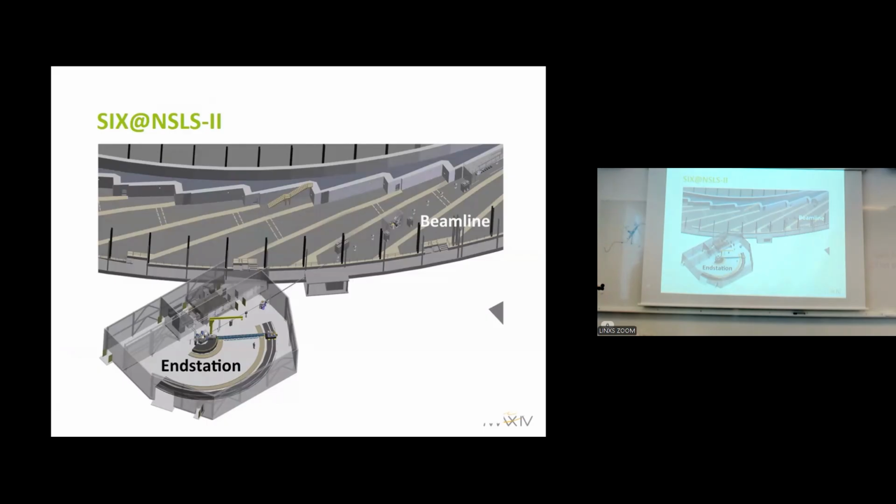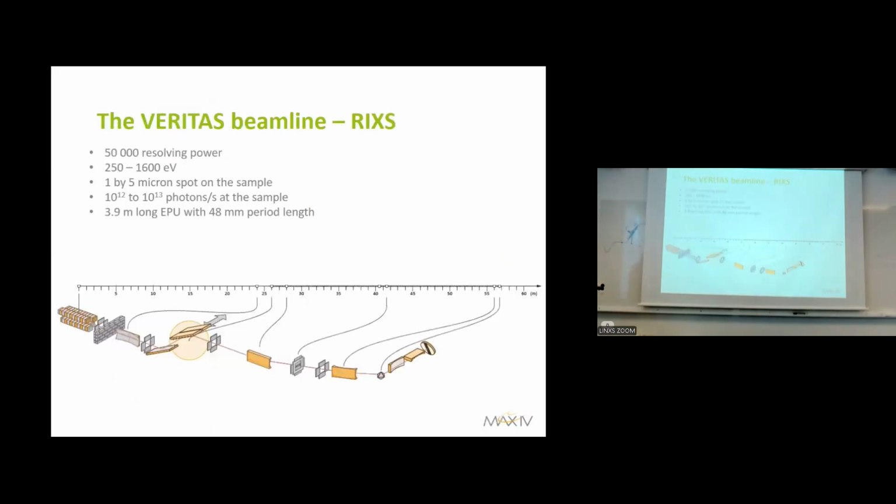And in general, the longer the beamline, the lower the number of lines per millimeter you can use in your grating, and that means much higher throughput. So it's always a match between them. You can have 1 million resolving power, but then you have 1 photon in the experiment. And that's not going to help you much. So it's always a trade-off.